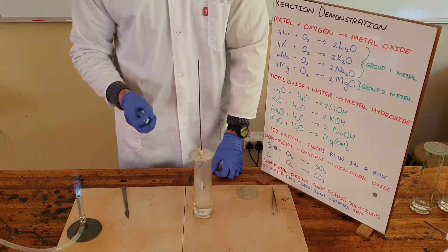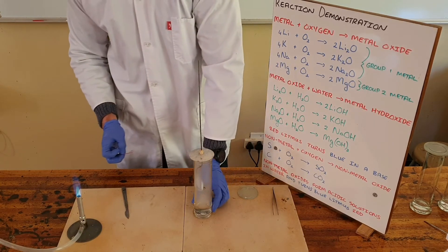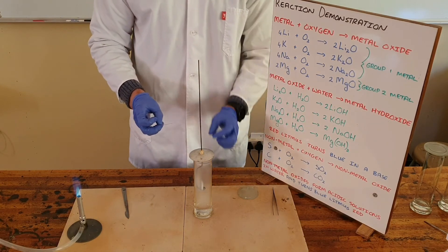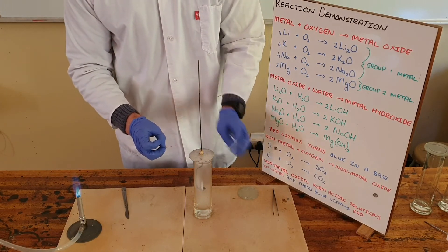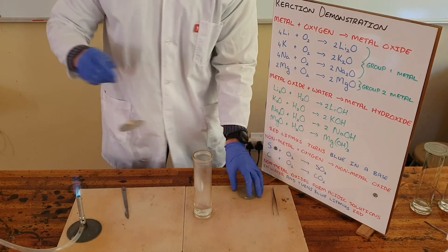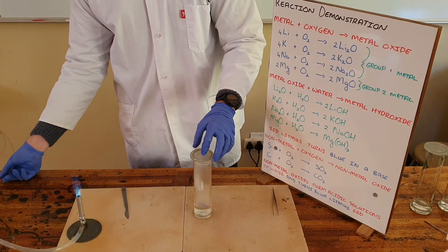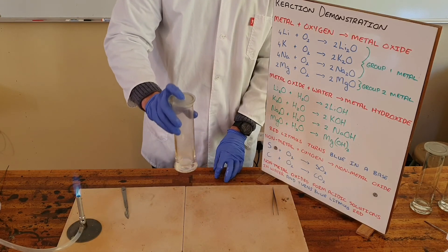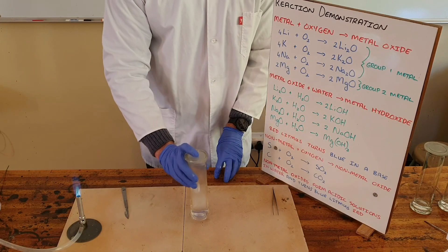So what's happened here is we have formed a certain amount of lithium oxide. Some of that lithium oxide has combined with the water that is present in the bottom of this gas jar. And what we can see now is that when we place the litmus paper in that water, we've got an alkaline solution. We can see that the red litmus paper turns blue almost instantaneously.